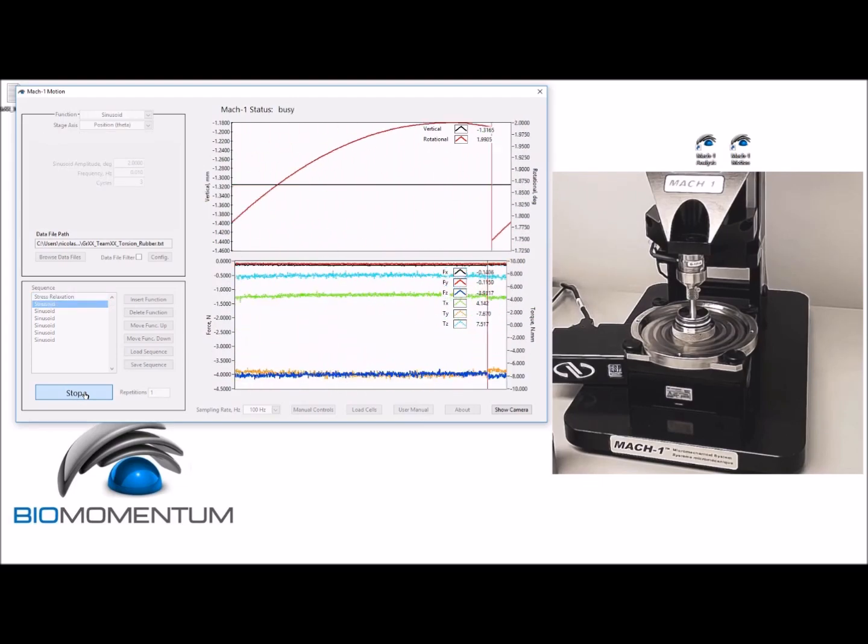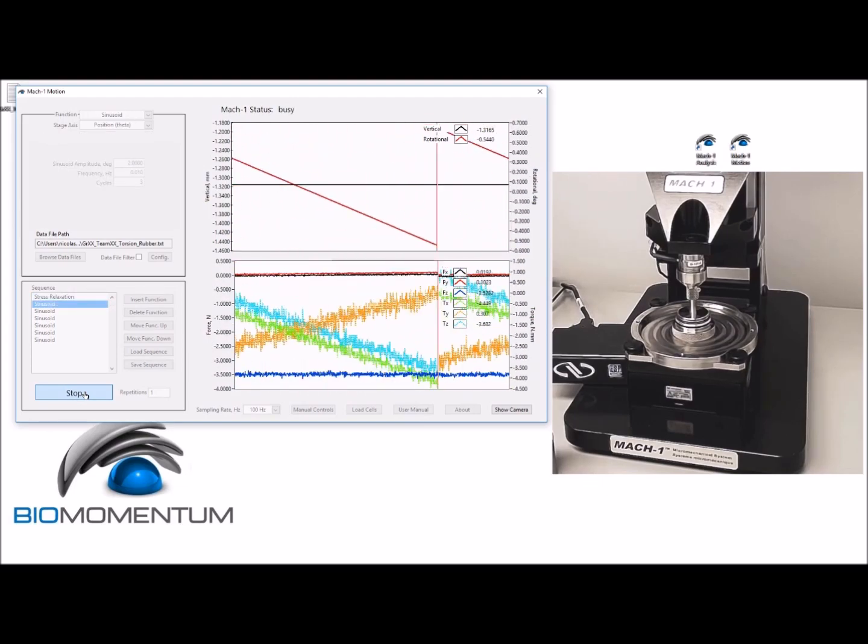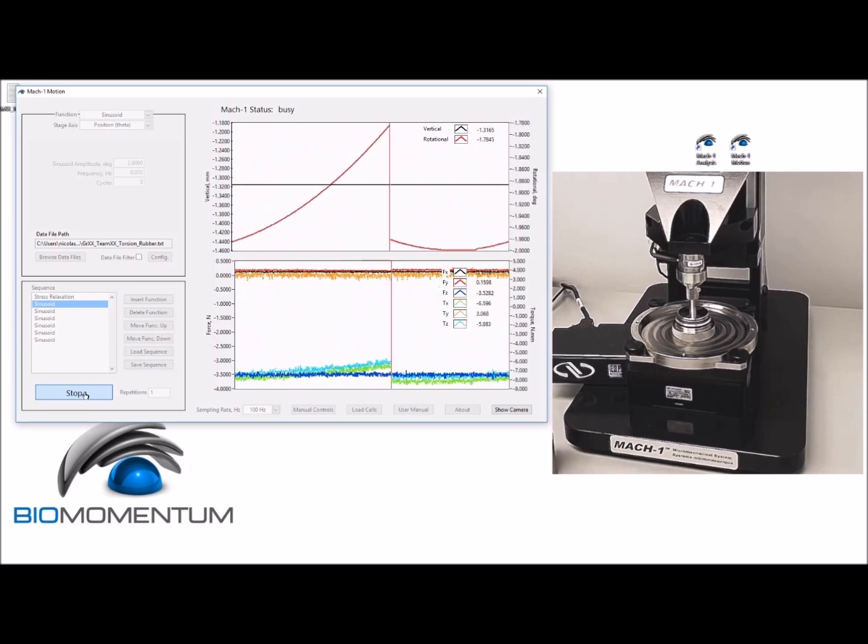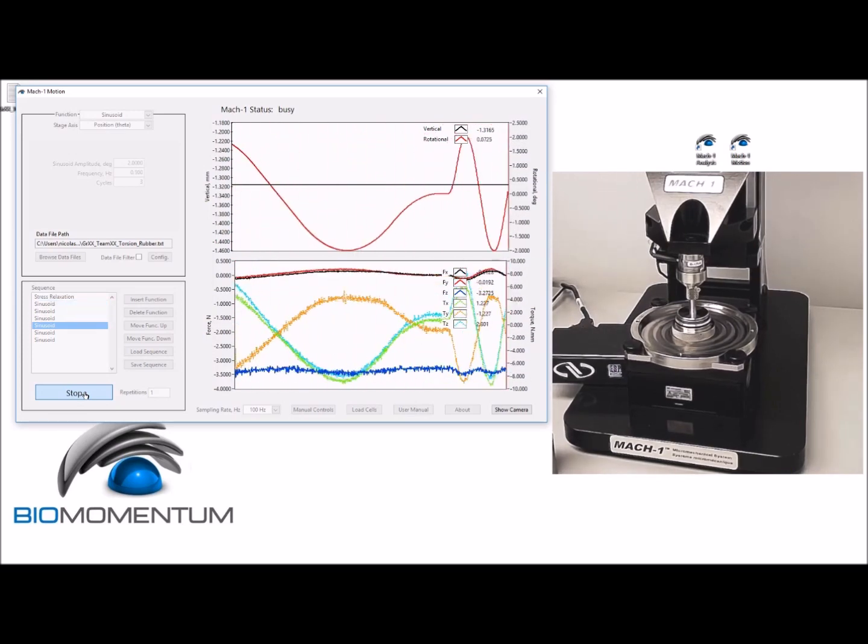And now the rubber is subjected to dynamic angular shear deformation through the sinusoid functions.